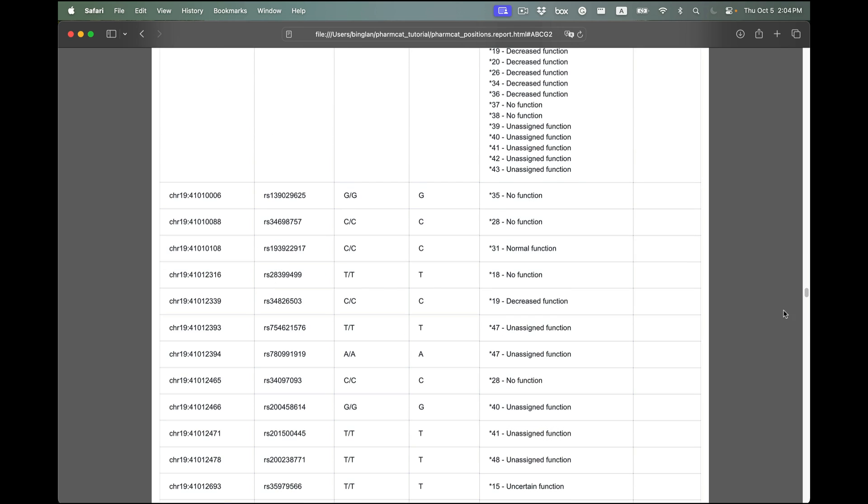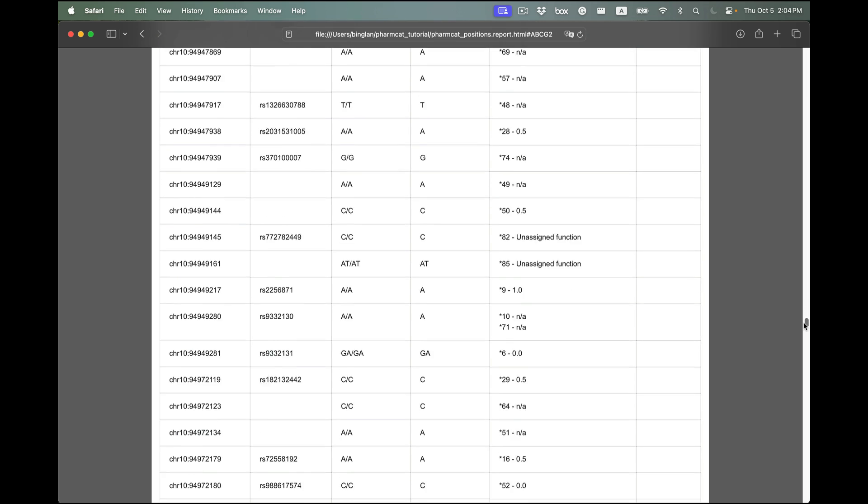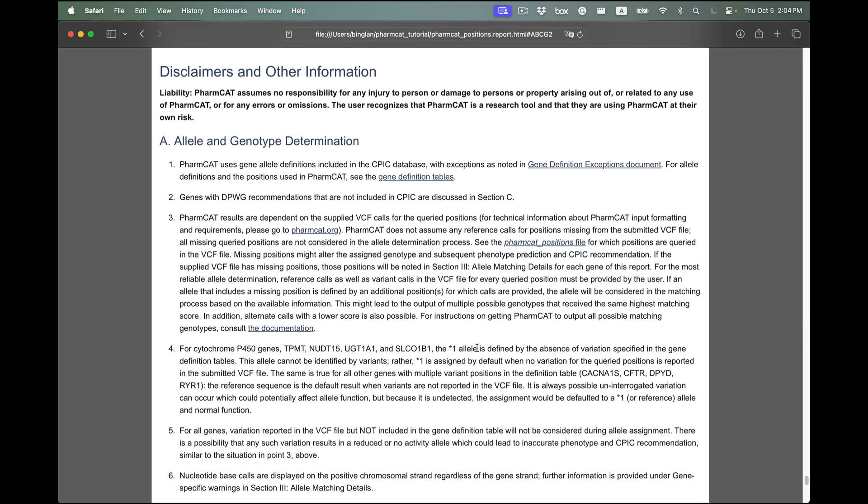Specifically, the last section, the disclaimer section, lists all of the exceptions, cautions, and warnings in interpreting results.